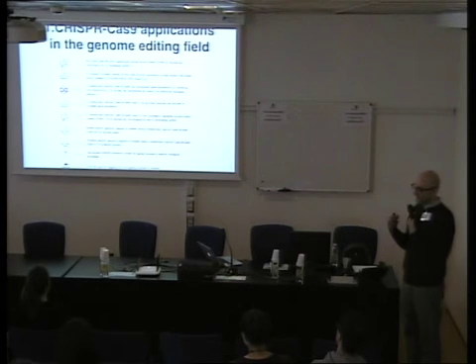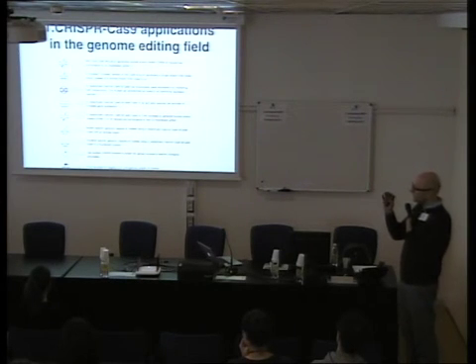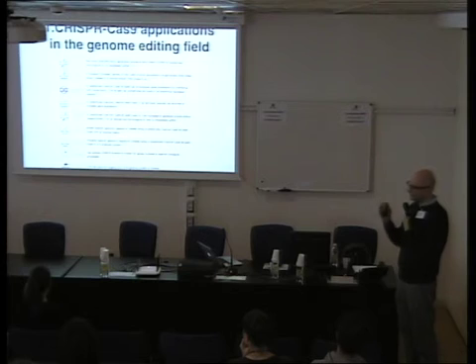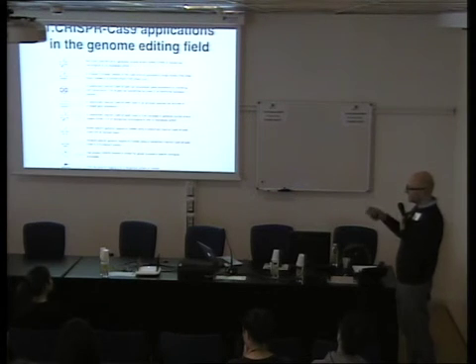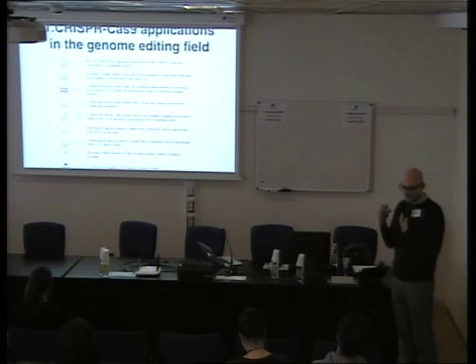Or you can even purify, because as I mentioned before, the system is sort of an antibody that recognizes the DNA sequence. So you can pull down a DNA sequence using the CRISPR and Cas9 system. It is a Cas9 that is mutated, so it doesn't generate a double-strand break, but with the guide RNA it binds to the DNA, and then you pull down, a sort of ChIP.